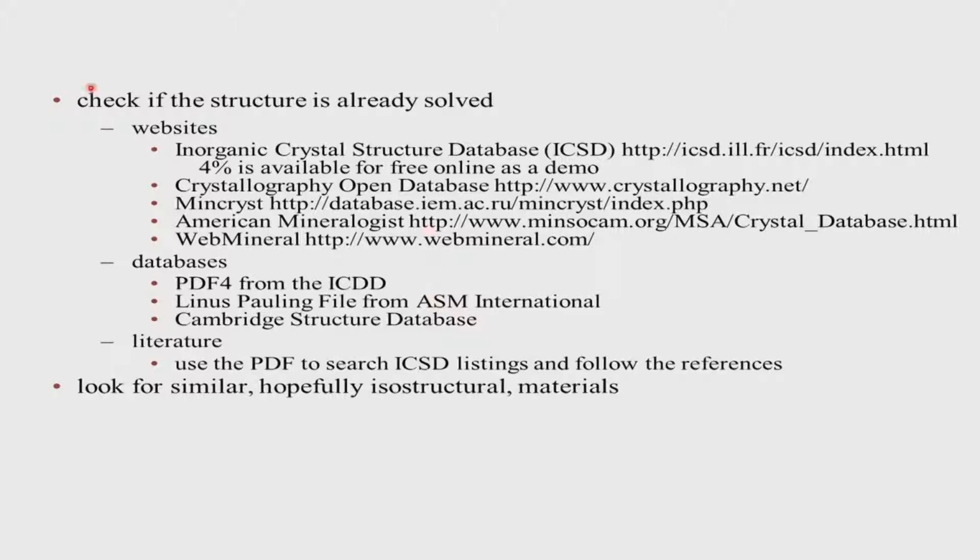So, first thing is we have to check, if we want to determine the structure, check if the structure is already solved. So, there are several websites which are going to help you out. One is the Inorganic Crystal Structure Database, ICSD, the web address of which I have given. And in fact, 4% of this is available for free online as a demo. So, one can use that and get an inkling of how to use the ICSD, and then it can be put on order.